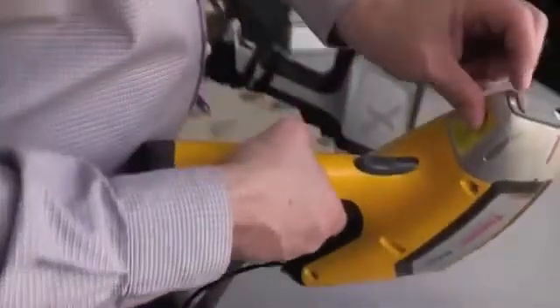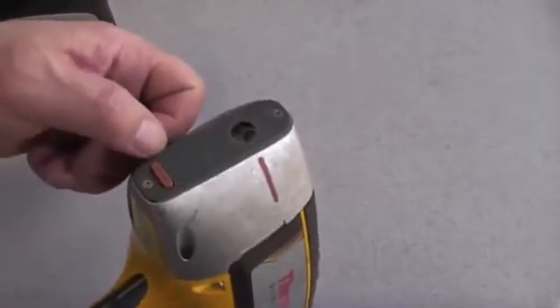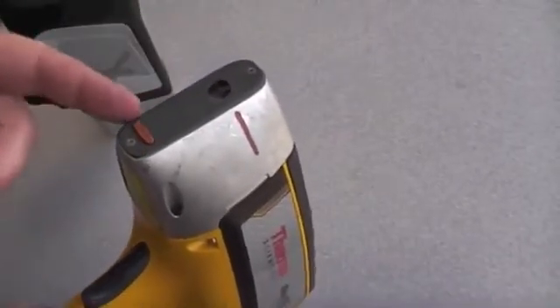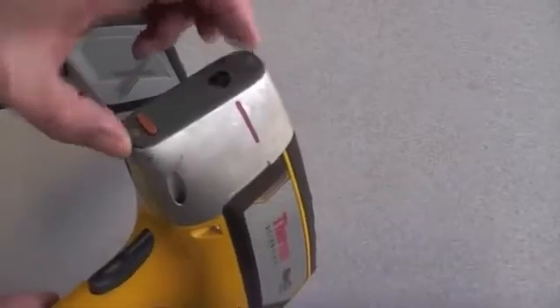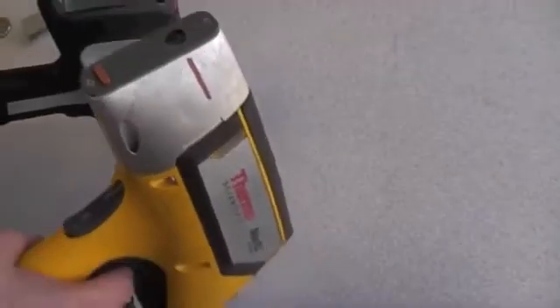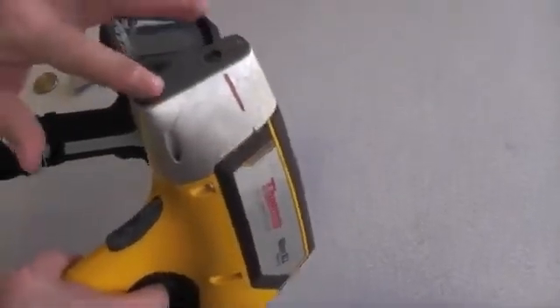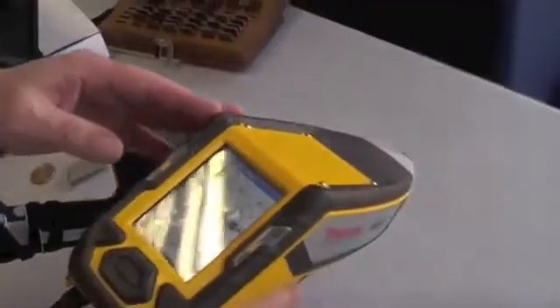Another thing ergonomically is this rubber bumper right there. If you're doing hot samples, this melts or burns right off. They recommend that you remove it, but it's actually glued on. So hot sampling, this is a built-in problem for it. It's interesting that that's still on there, artifact of an isotope system.